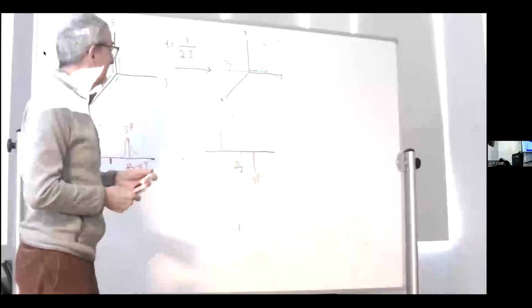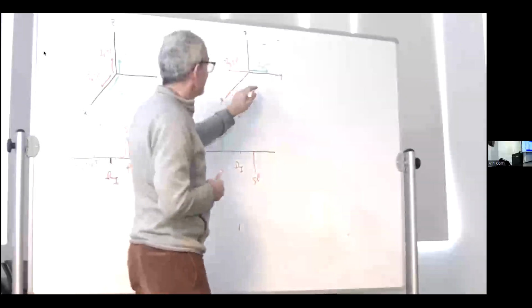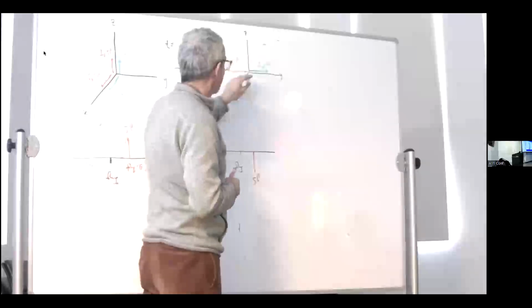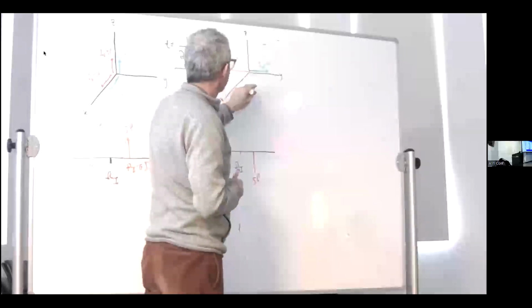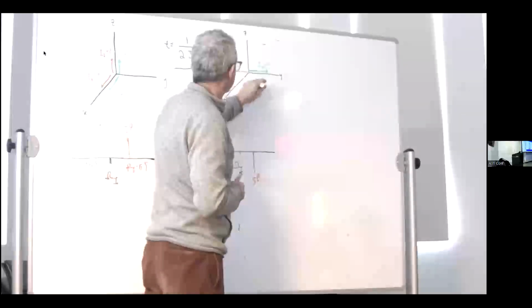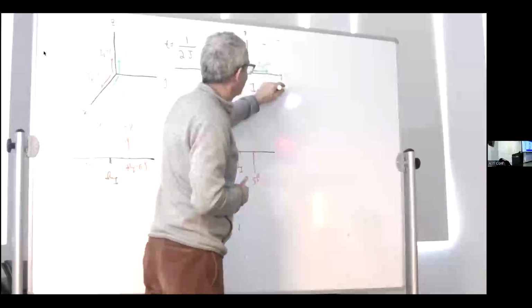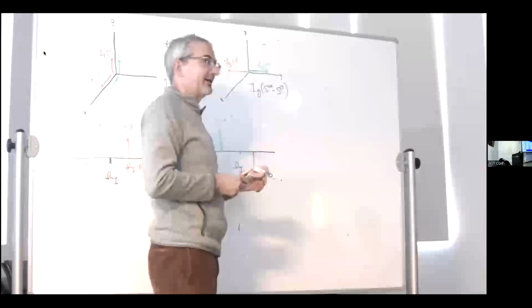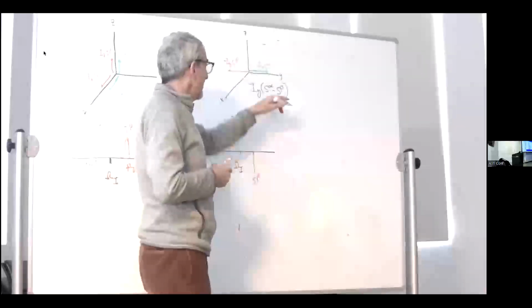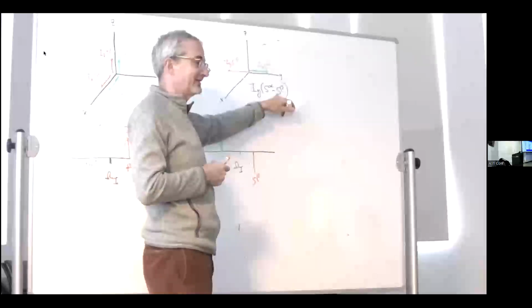And here, as I said, my language says I can define a new operator because the total coherence here is IY times (S alpha minus S beta). And in my symbol world, 1/2 (S alpha minus S beta) is SZ magnetization.